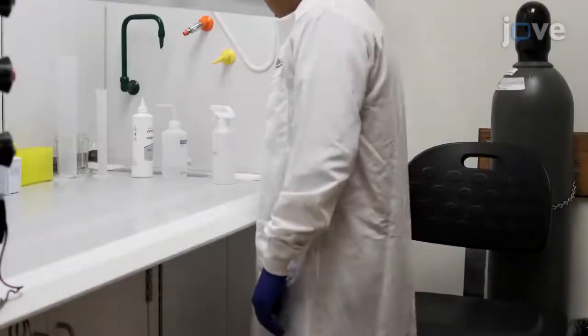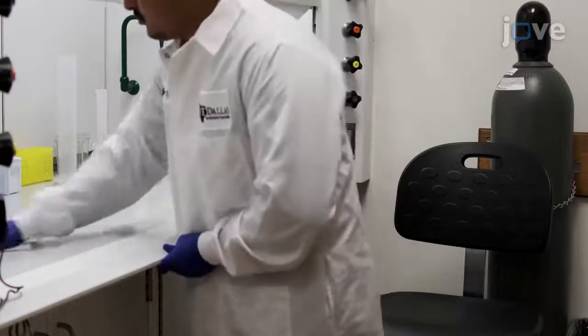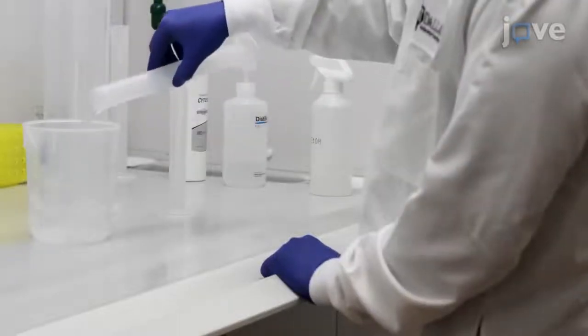To begin this procedure, clean an empty fume hood or appropriately fitted biosafety cabinet with 70% ethanol. Prepare all of the necessary buffers and reagents as outlined in the text protocol.